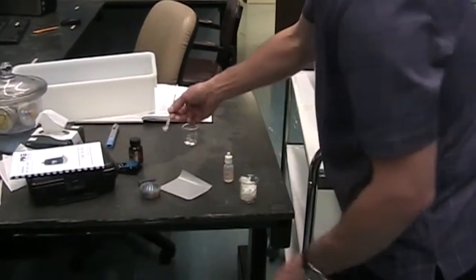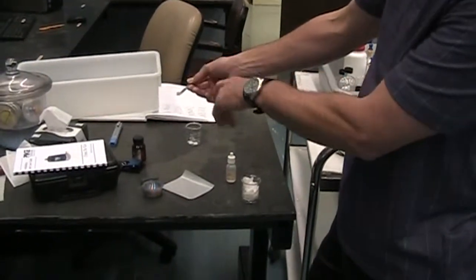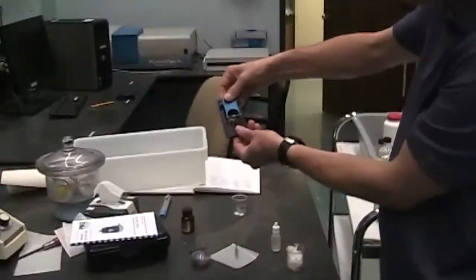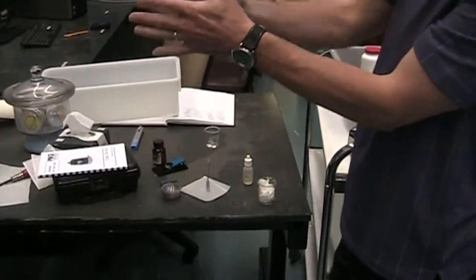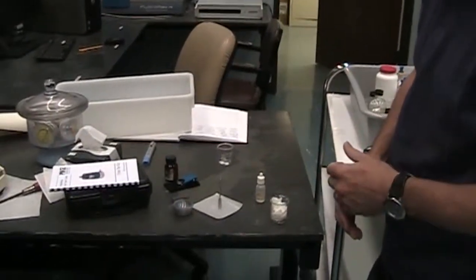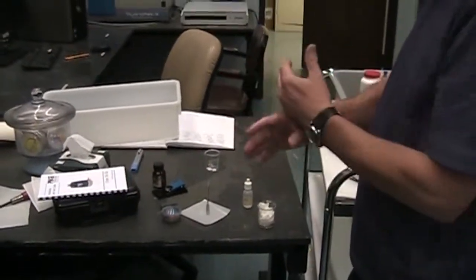But basically, we have these salt plates. We'll put some of that Nujol mull with the sample suspended in a salt plate, put another salt plate on top to make a sandwich. And again, that's just the right size to fit into our sample holder. So you'll have a salt plate, Nujol mull, another salt plate in the sample holder, and you'll be able to shine the infrared beam in the spectrometer through the sample.